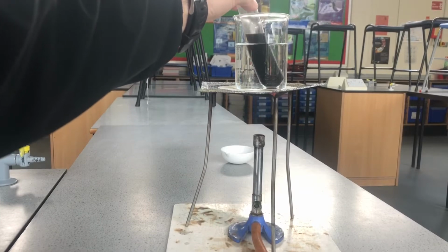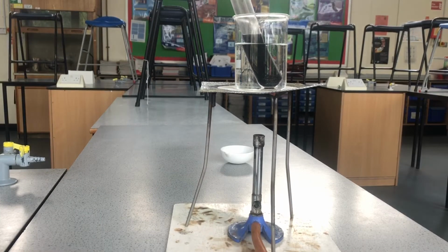We'll leave that for a minute or two to heat up and get warm. Hopefully, maybe we might see some of the copper oxide settling out, and we might start to see some observations of the reaction. If not, we'll filter it and we'll see more then.